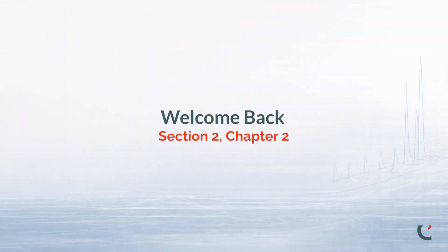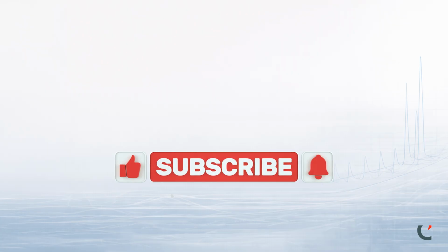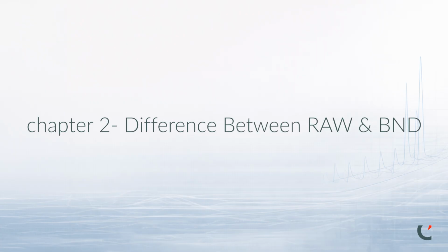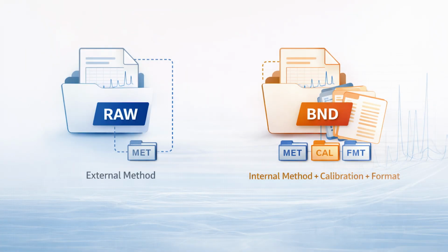This is Section 2, Chapter 2. In the previous chapter, we introduced the core file types used by Chromperfect. In this chapter, we focus on two of the most important, the raw data file and the bound data file. Understanding the difference between these two file types is critical because it directly affects how you store, review, archive, and defend your analytical results. Instinctively, new users often gravitate toward using raw files as their primary working and archive format. In almost every case, this is a mistake and can create serious problems later.